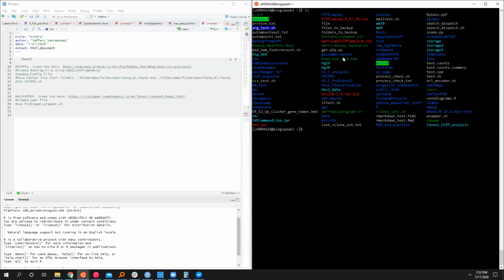It's going to be a little tricky because the analysis is of big enough files that I'm not going to be able to do it here to show you how it goes. But I'm going to be showing you some stuff that we've worked with, where HiC has made some HiChIP libraries, to show you what the outputs look like and what the setup looks like.